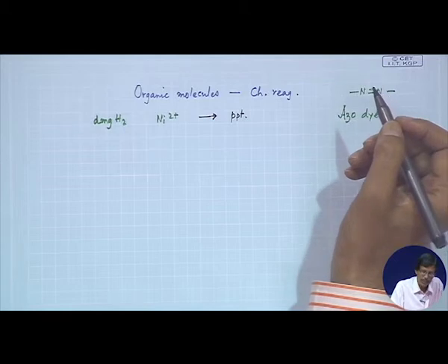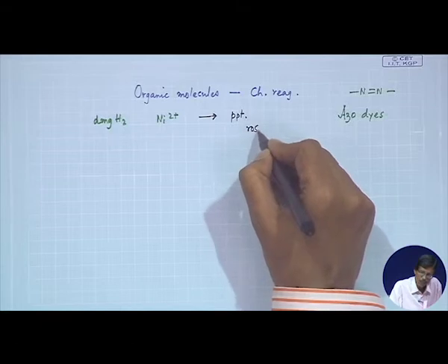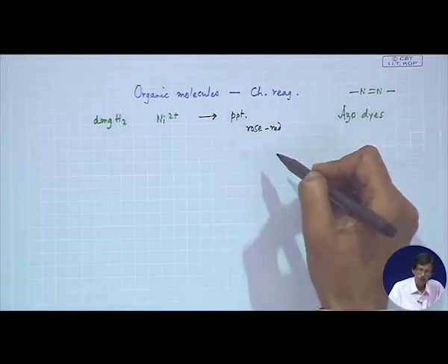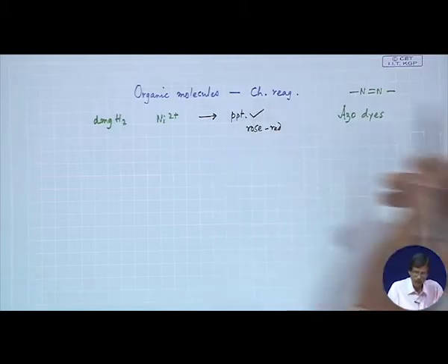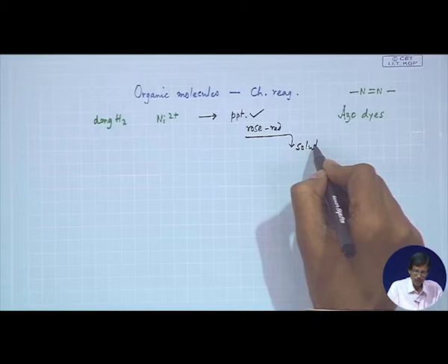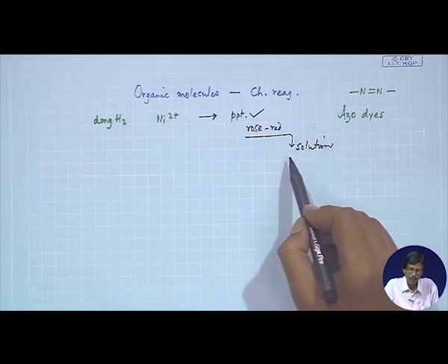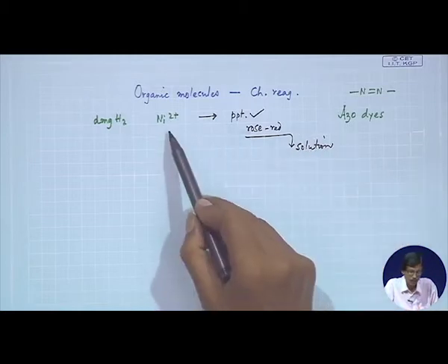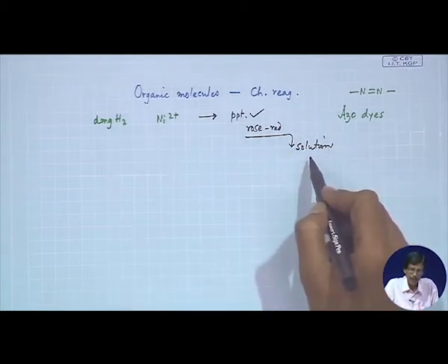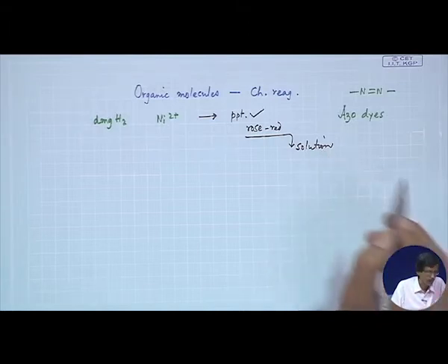So, it is rose red precipitate. Gravimetric estimation can also be useful, but now we can utilize that coloration. That means, in very dilute solution, if we try to avoid this particular precipitation, we can have this rose red coloration in solution. Once we can develop some coloration in solution, we can measure the intensity of that color related to the concentration of either Ni2+ or DMG, as a spectrometric method for identification of an unknown analyte.